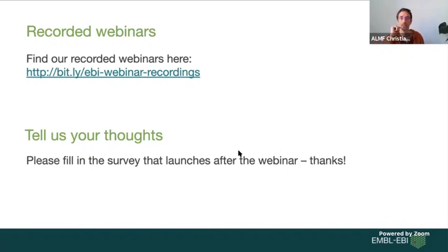Ramakrishna, what is a good method of documenting an image analysis pipeline? Yes, so basically the best way is you just write code. If it's a script that you run, then this is the best documentation. If you use Fiji, then actually macro recording yourself when you click around is the best way to document it.